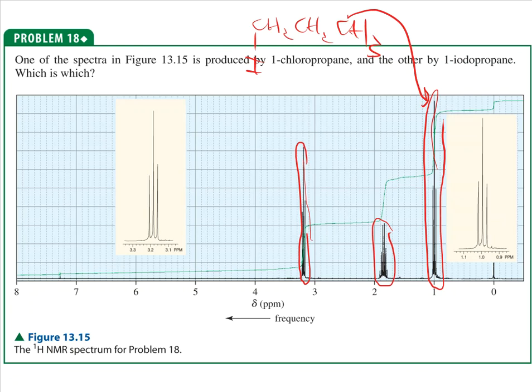This is the next furthest away. That will be the next easiest one to flip, and that's happening right before a 2 ppm. And this is the closest to the electronegative atom. That will be the hardest to flip, and that will happen at a little above a 3 ppm. All right, so point of reference, again, it's all about tying all of these together into one nice little package.